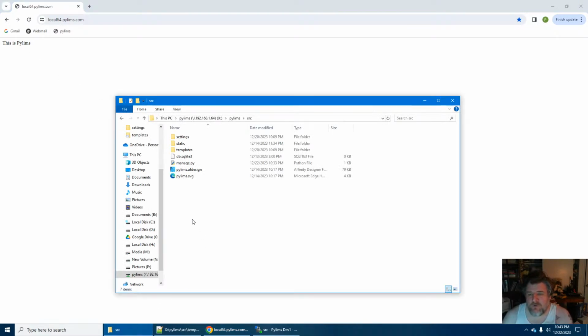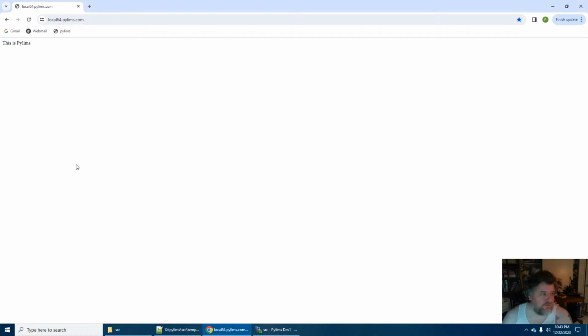Alright, I almost have no idea where to start. I don't think I need that. Maybe I shouldn't. Okay.